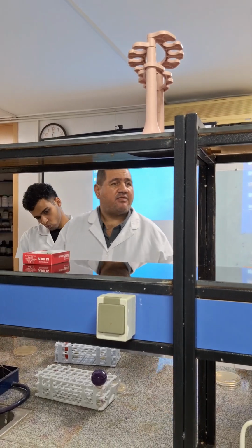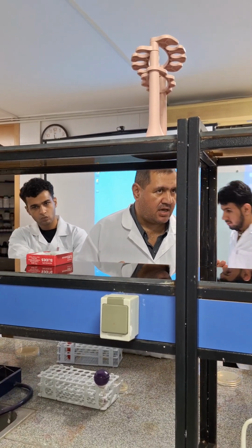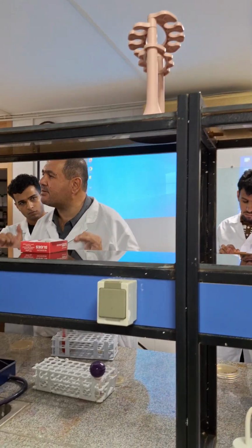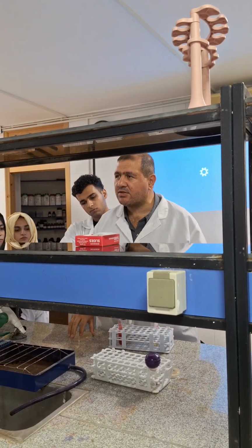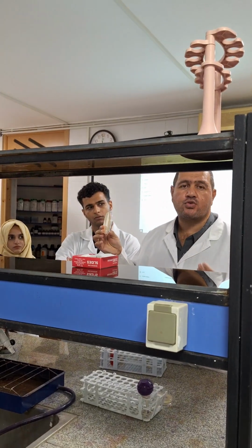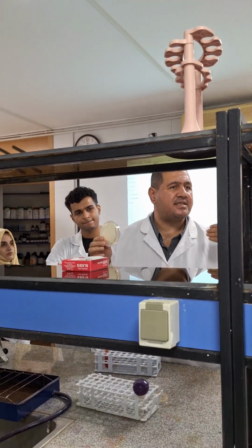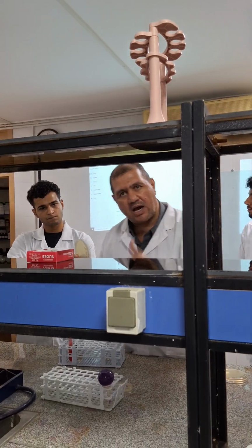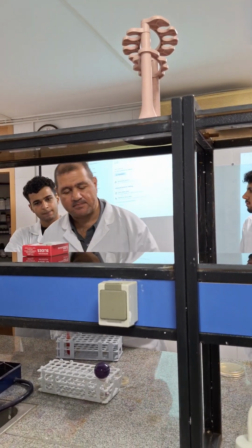According to the function of media, there are 4 groups of media. Basic media such as nutrient agar and nutrient broth are used to culture non-fastidious bacteria, for example, E. coli, Staph aureus.